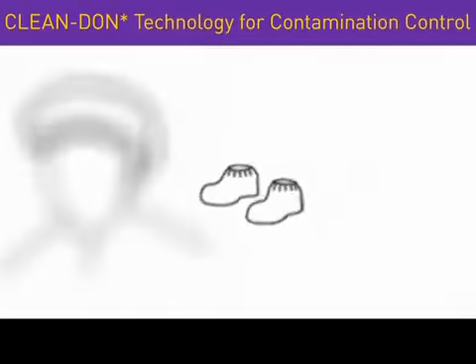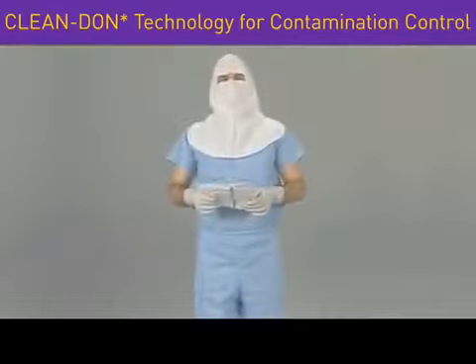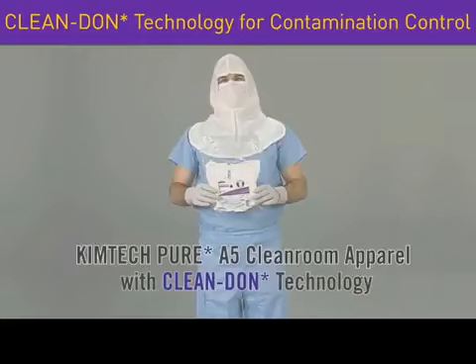Once you have completed the first few steps of the gowning process, it is time to don the coverall. You've got the new KimTech Pure A5 Cleanroom Apparel with CleanDon Technology. This will be a snap.